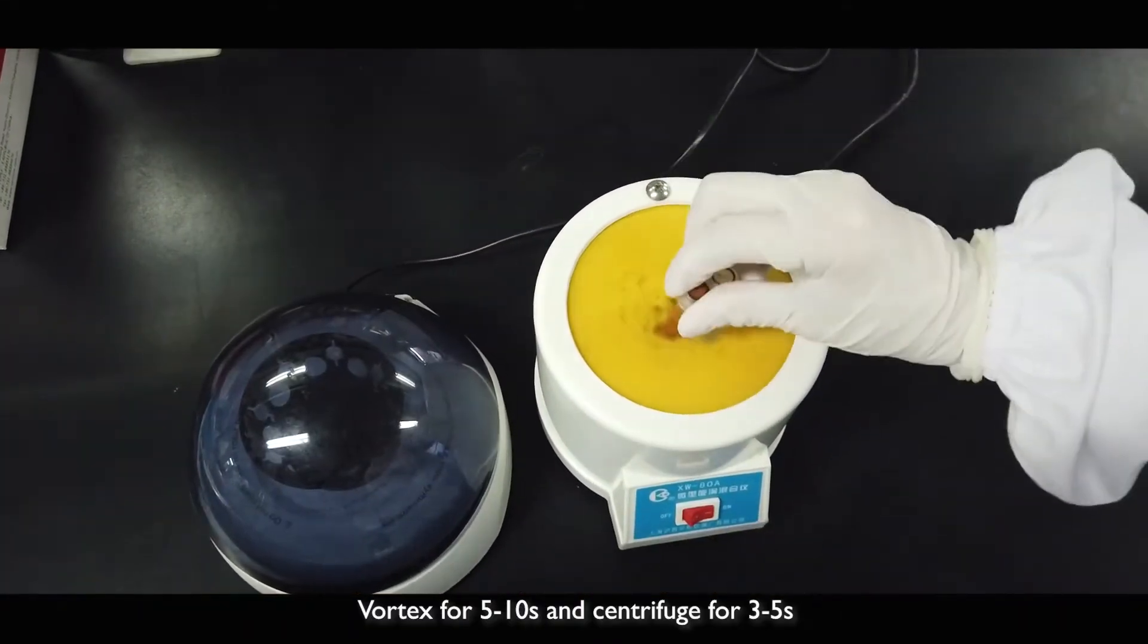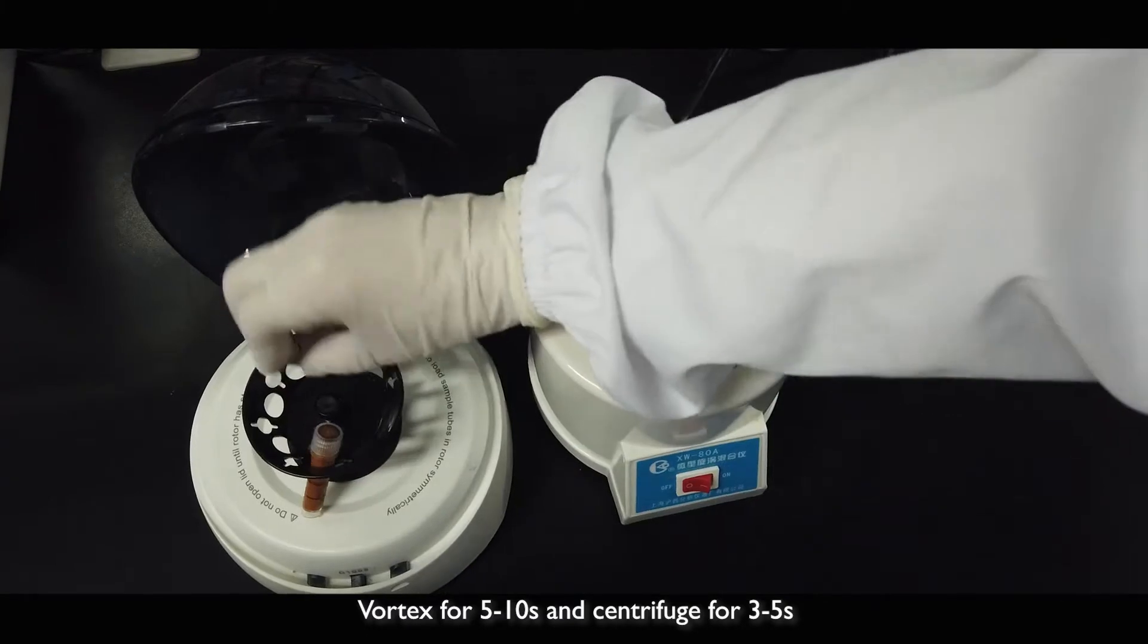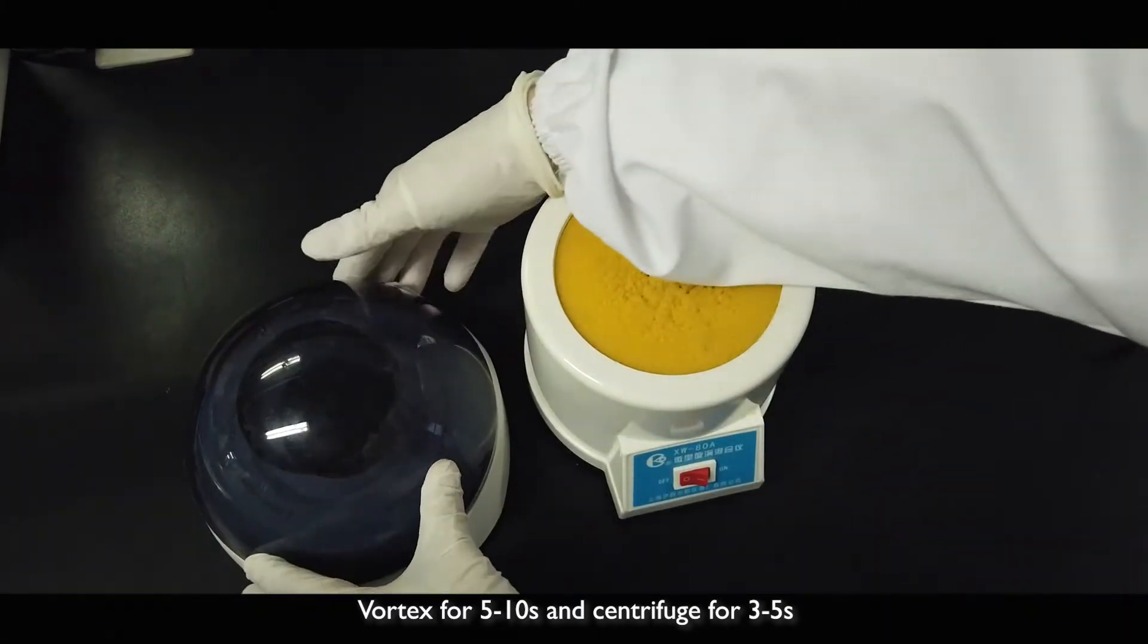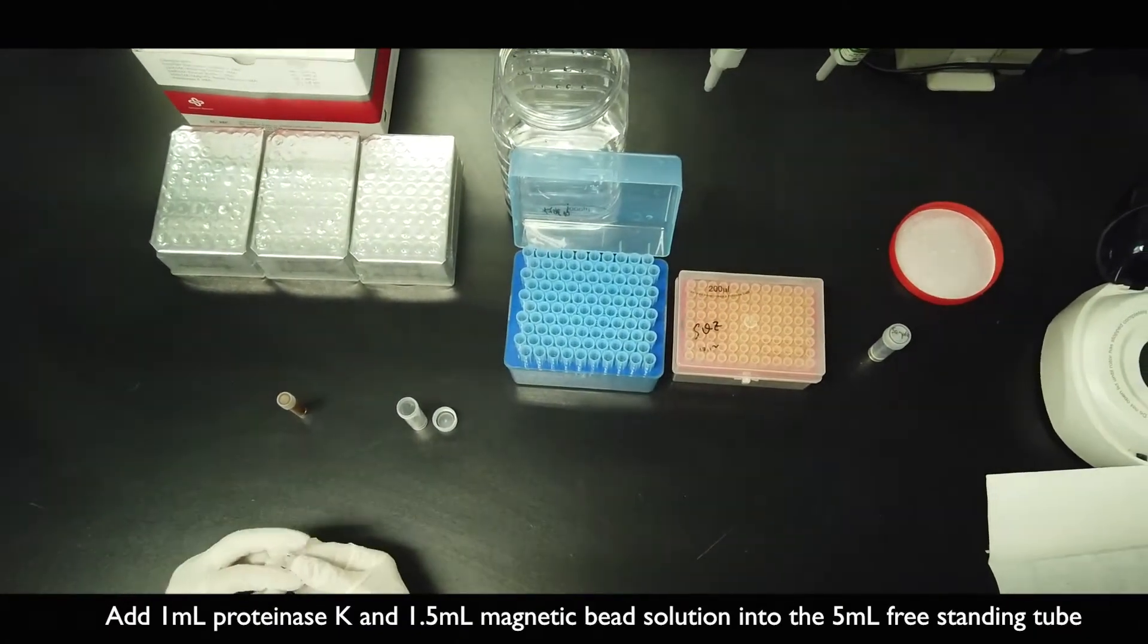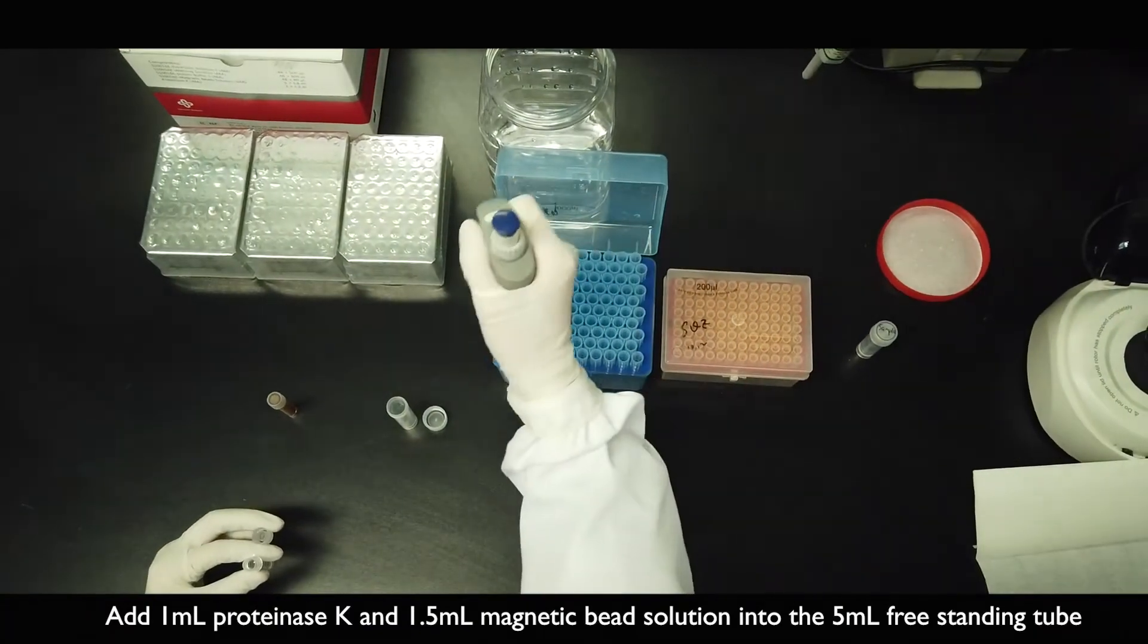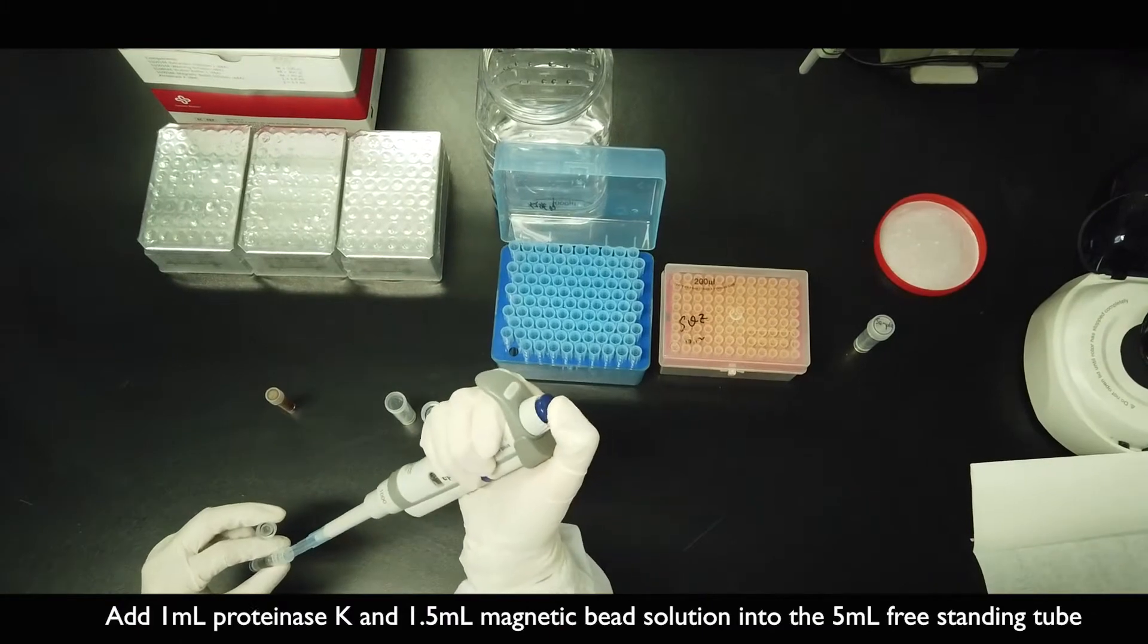Vortex for 5 to 10 seconds and centrifuge for 3 to 5 seconds. Add 1 mL proteinase K and 1.5 mL magnetic bead solution into the 5 mL freestanding tube.